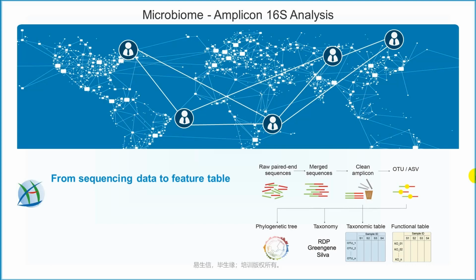In this video, we will get started with RStudio and run the EasyAmplicon pipeline step by step. Basically, microbiome data analysis is mainly divided into 3 steps and is suitable for the analysis of multi-omics data based on second-generation sequencing. Converting big data into human readable graphs and reducing the dimensionality for better visualization.